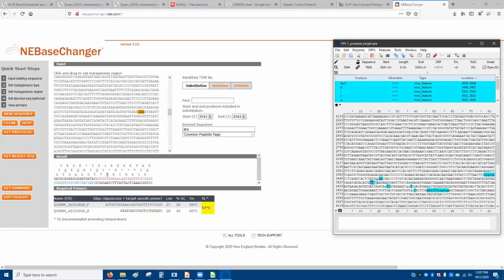For some reason I'm out of it. Looking at too many letters. ADD, TVL. Why is it called that? This is why we always double check the computers.